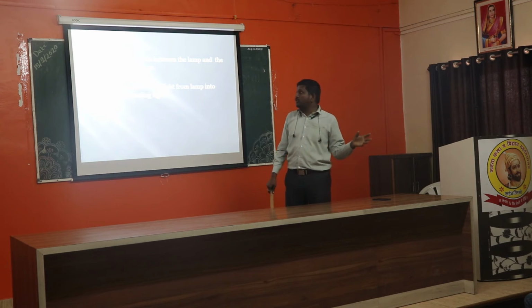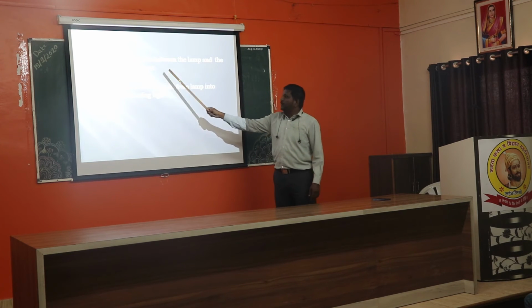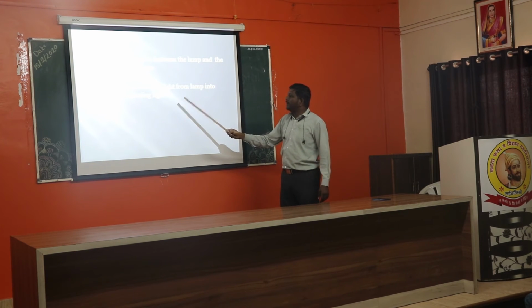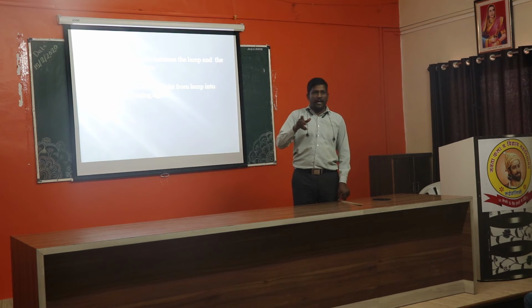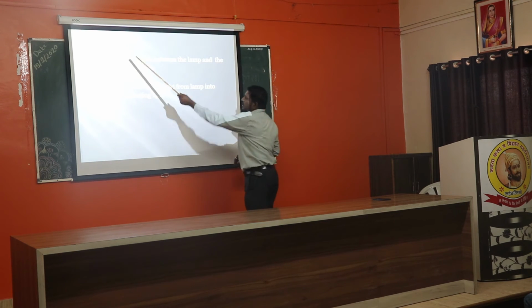It is used to break the steady light from the lamp into intermittent or pulsing light. As the wheel rotates, the light is cut on and off. In this way you get the light due to the chopper.